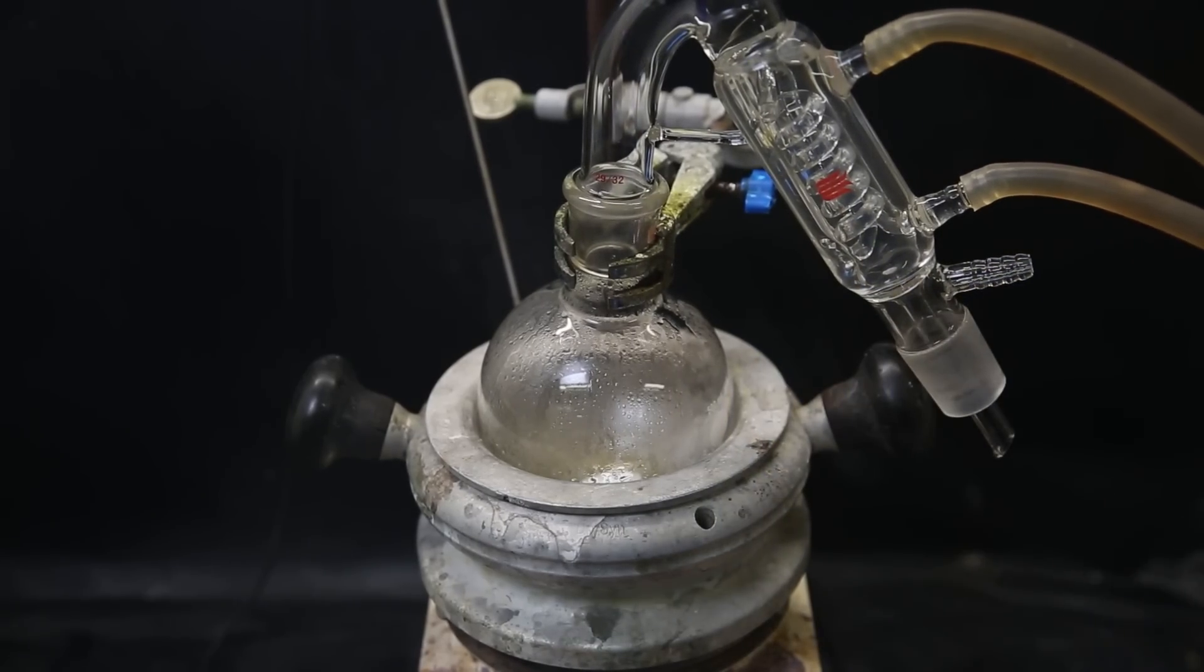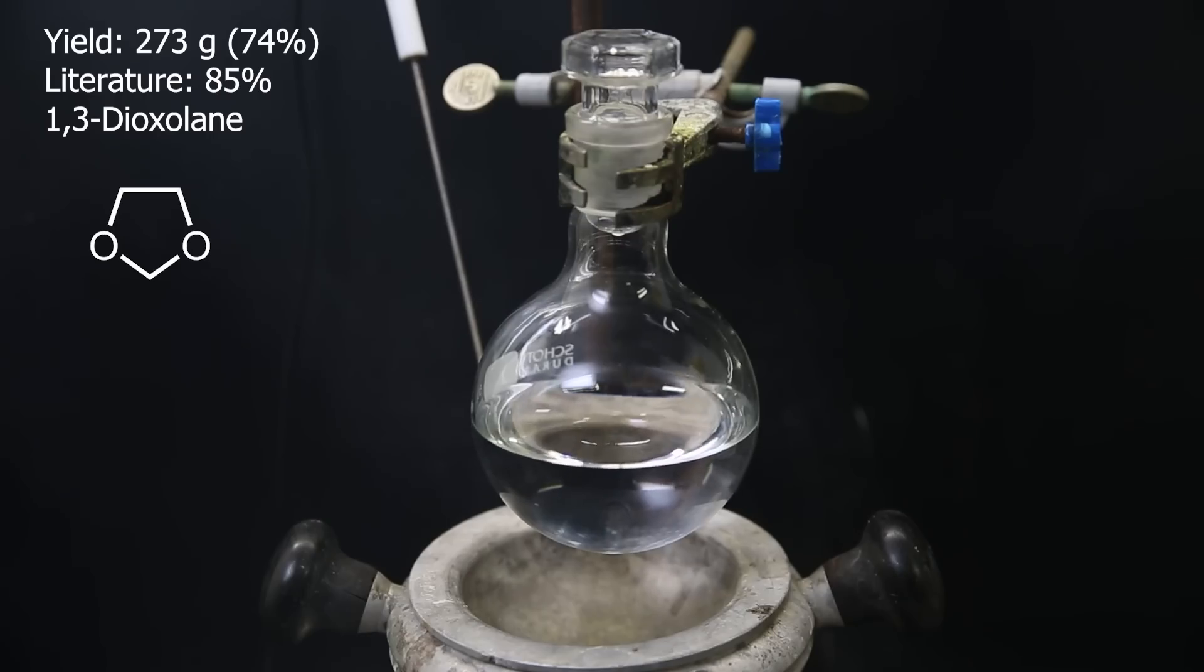I take the flask containing the 1,3-dioxalane, and the yield turned out to be 273 grams, which is 74%. This is a pretty decent yield, and the reaction is not dirty at all compared to something like a dioxane or diethyl ether synthesis. The literature had a yield of 85%, but I didn't run the reaction until the temperature they mentioned, and I didn't supply sulfur dioxide constantly. Also, I probably lost some with the splashing.